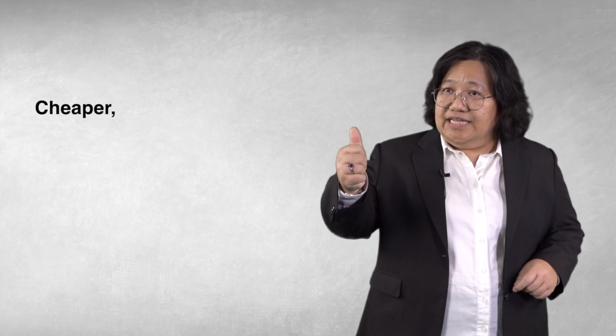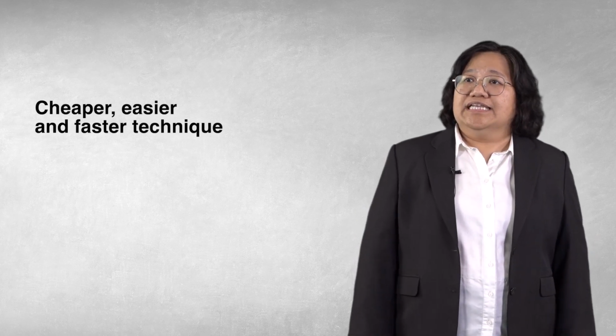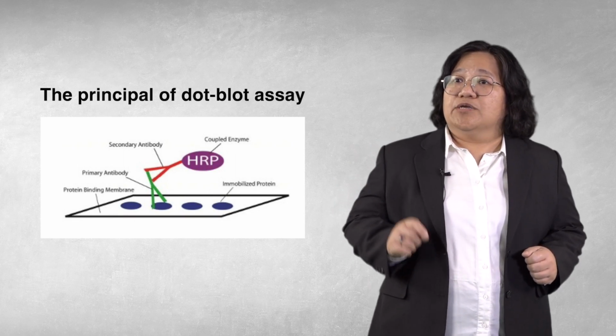In this study, we developed an assay based on the Dot-Blot assay platform. Dot-Blot assay is a cheaper, easier, and faster technique to detect the presence of protein in a biological sample. It works based on the immunodetection principle for identifying specific protein. Generally, in the assay, protein is immobilized on the membrane, followed by successive incubations with primary and secondary antibodies that carry a tag to allow visualization.